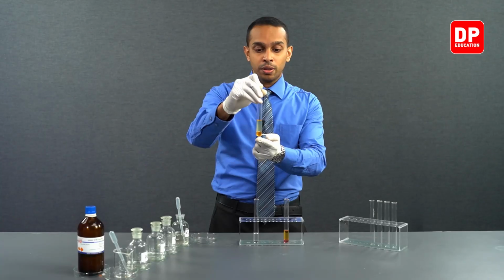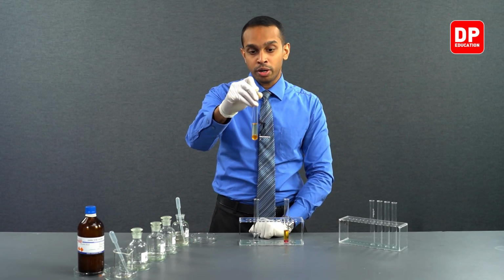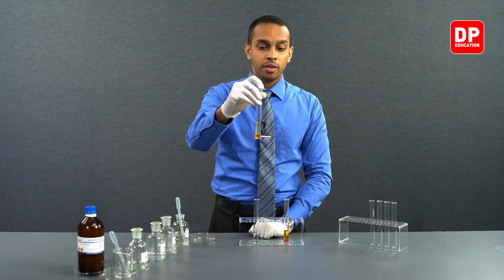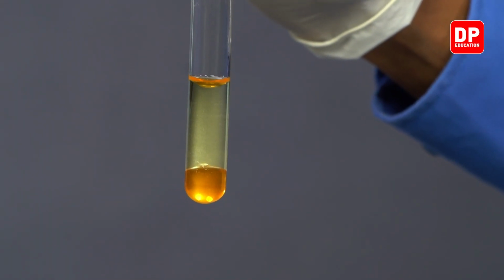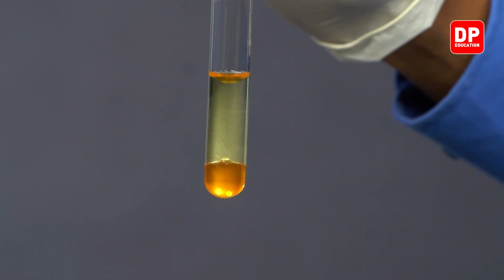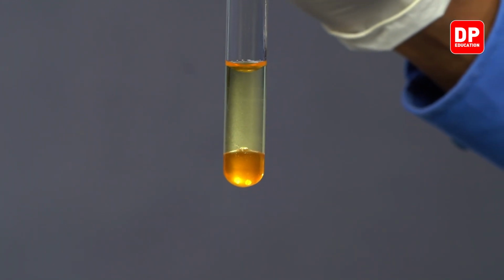So the organic layer turning orange upon addition of chlorine water into a bromide ion solution and then shaking the solution well is evidence of bromide ions being present in the solution. So when you want to test for bromide ions, this is one test that can be done.